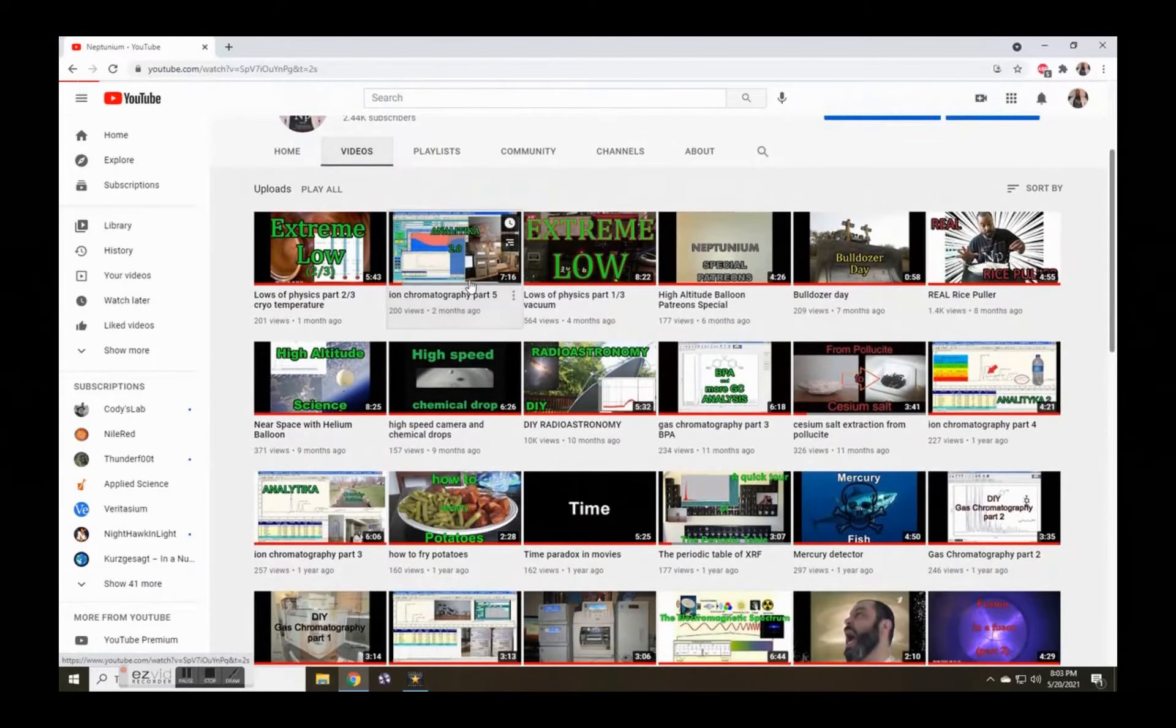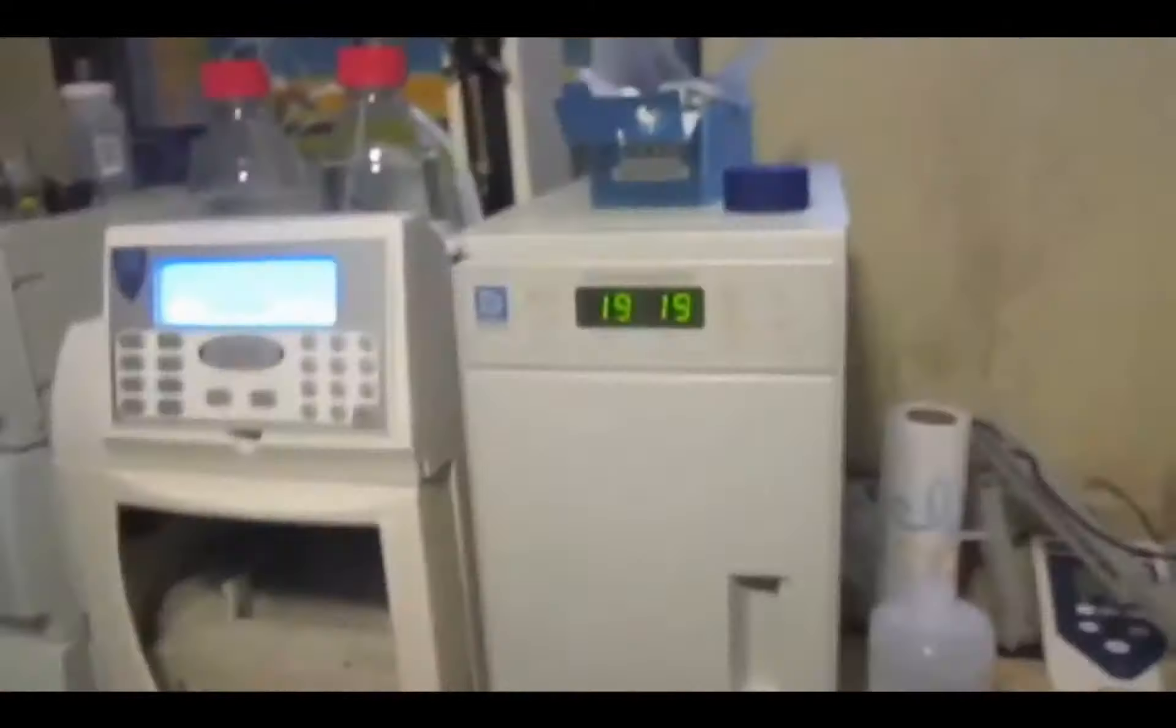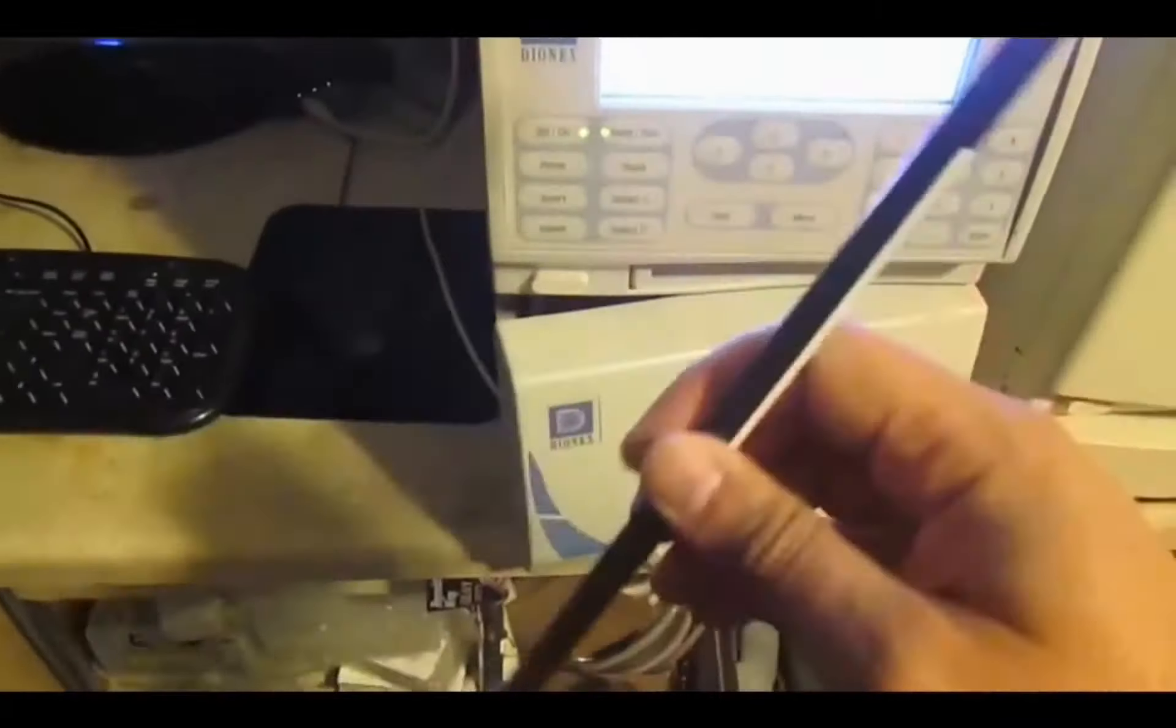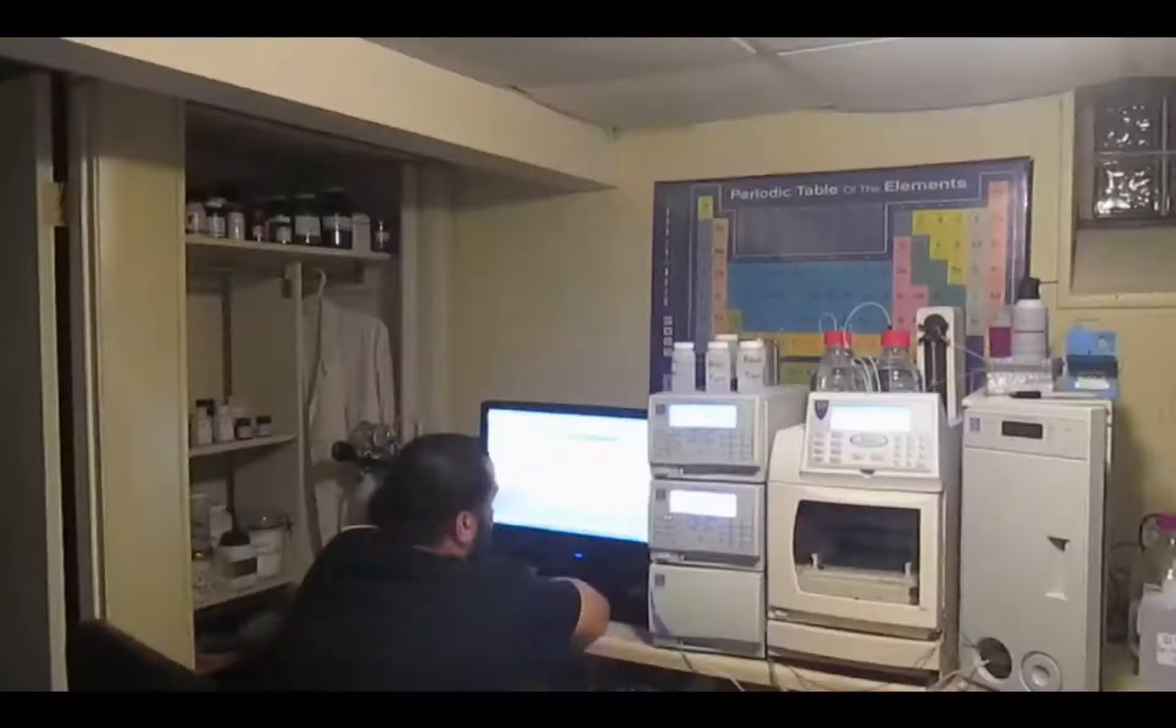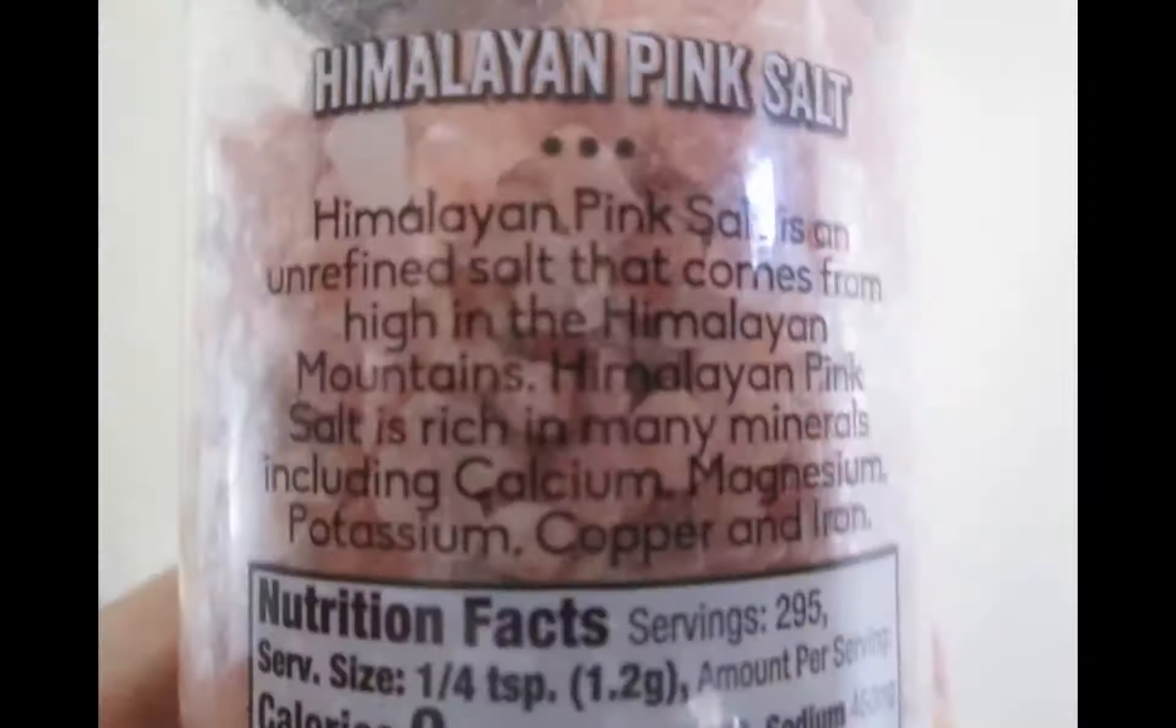Hello and welcome. On the previous Ion Chromatograph video, I analyzed a variety of commonly found items ranging from food to body fluid. I reported finding fluoride in my urine and in my whiskey, which I thought was odd, and since no one called me out on this, I'll just call myself out.